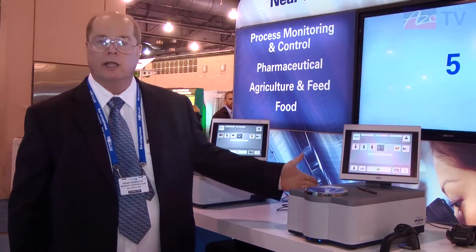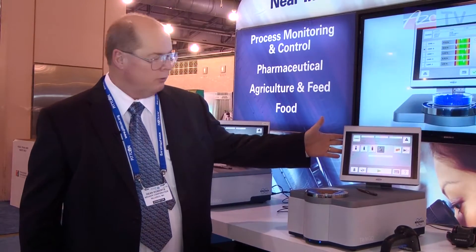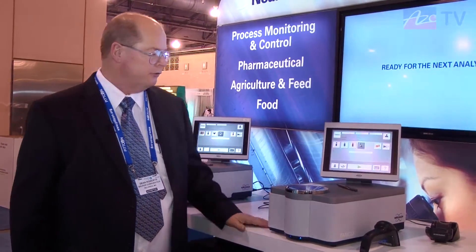The Tango is a self-contained unit featuring an embedded PC with touch panel control. It's pre-calibrated for all of the major applications in the food, beverage, and agricultural products industry.